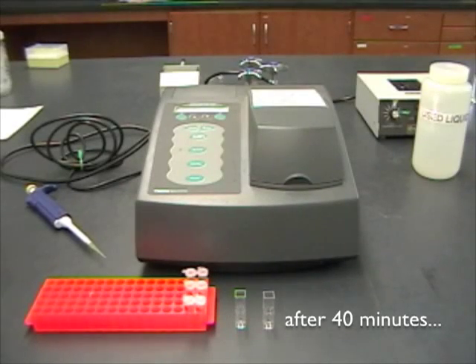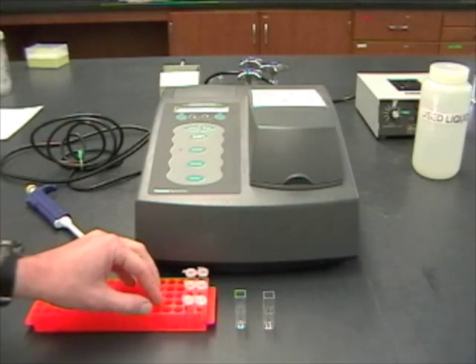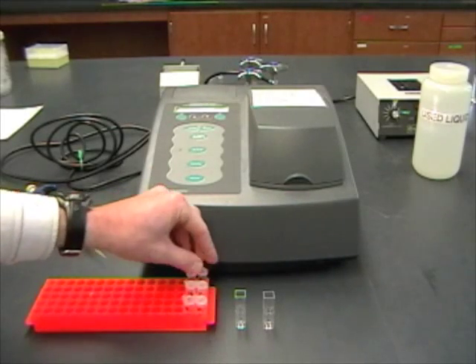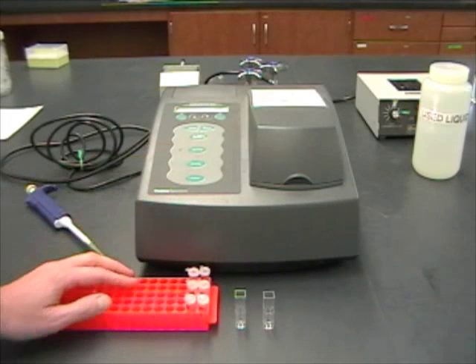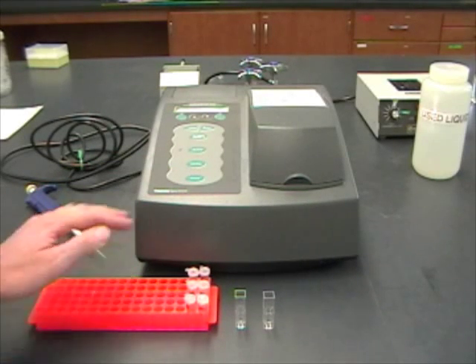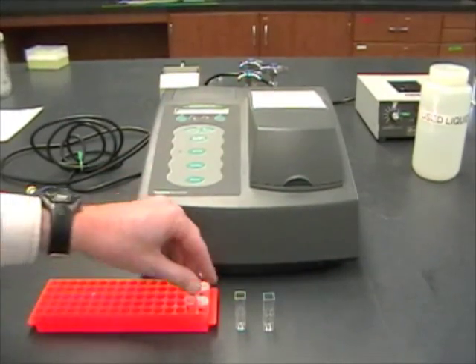Now we're ready to determine how much of the yellow product was produced in each tube, and that's going to give us an indication of the enzyme activity. I've waited until the whole experiment's done and I've got all my time points finished with the stop solution in them. It's okay to wait until you're finished and then just analyze all the samples quickly.